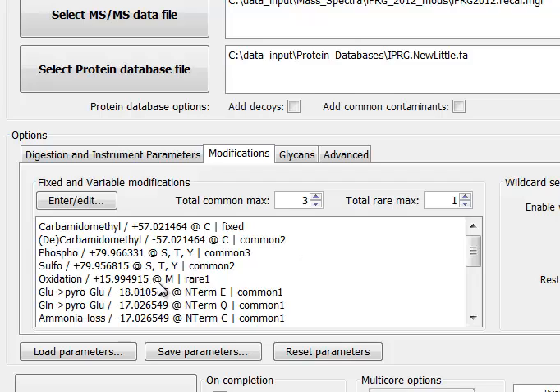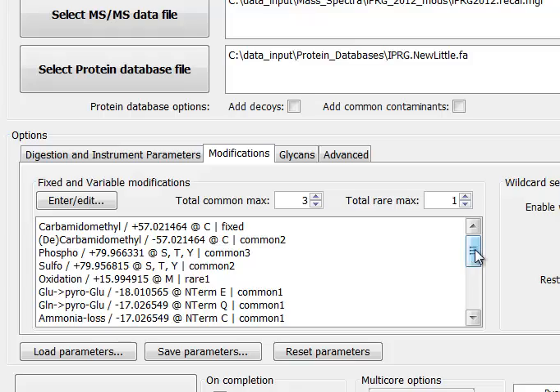The next modification is oxidized methionine, and we set that as rare one. That will be counted against an allowance of at most one rare modification per peptide. So together, the two allowances mean we'll be looking for peptides with at most four modifications total.